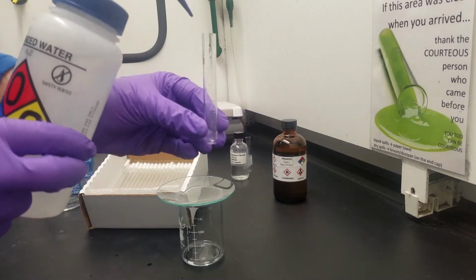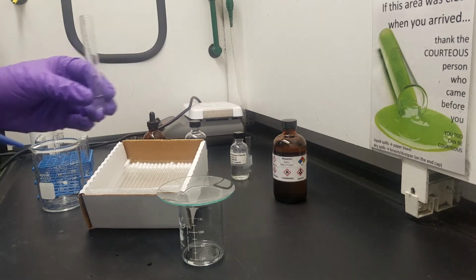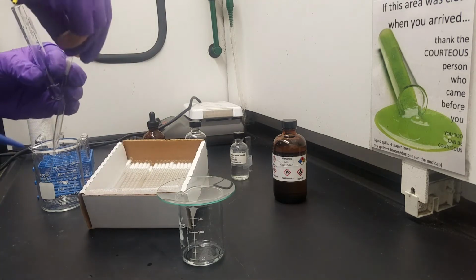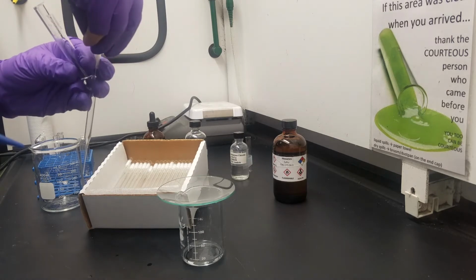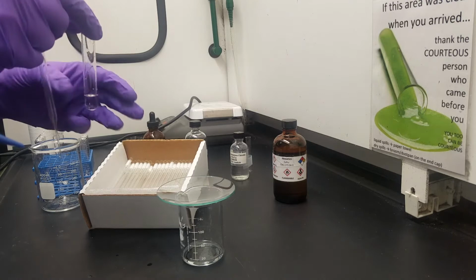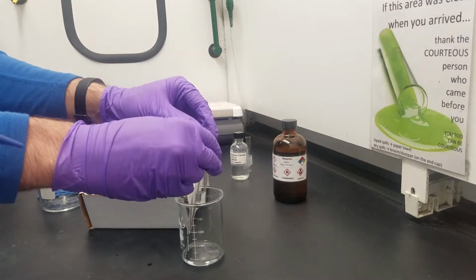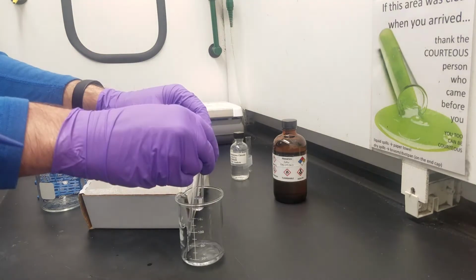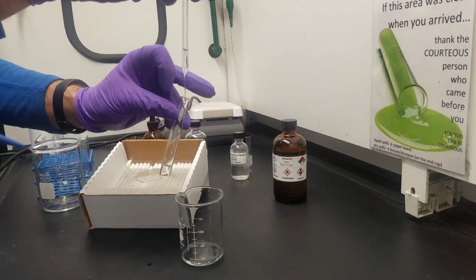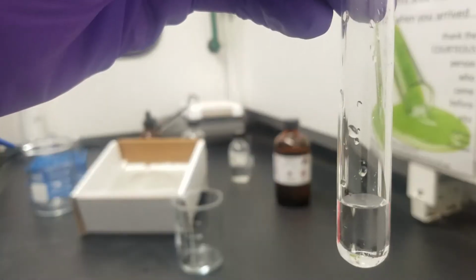And just like the last one, we'll do water first before we add the hexanes. The hexanes is again going to be added via a glass pipette. So we want to make sure that we get that rubber pipette bulb on, keep the tip always aimed down so the liquid doesn't rise up into the pipette or into the pipette bulb. And we can suck up our liquid, do a couple spits just to ensure we don't get any back spitting, and then careful hand gestures here so that we can align it.